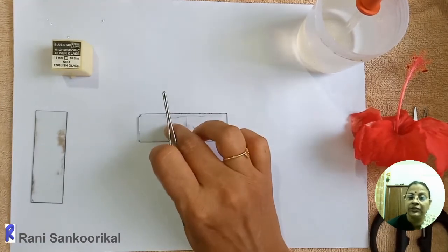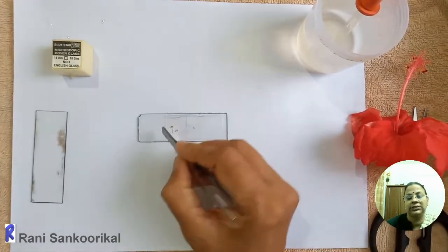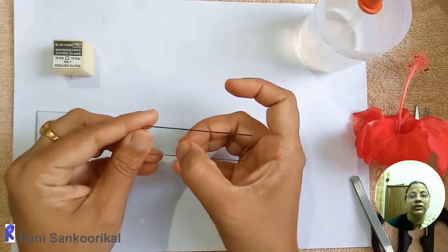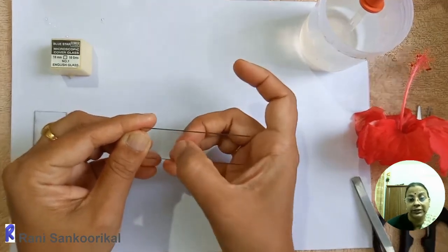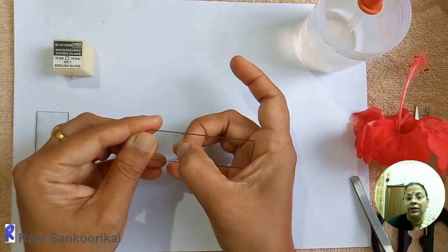So you can just with the finger itself, you can press it gently on that and just squash it. So when you are squashing it, you have to be very, very careful, otherwise cover slip, it is very fragile only. So with the finger itself, like this what I showed, in that manner you can just press it so that you can see the pollen grains, that smashed appearance of the anther.